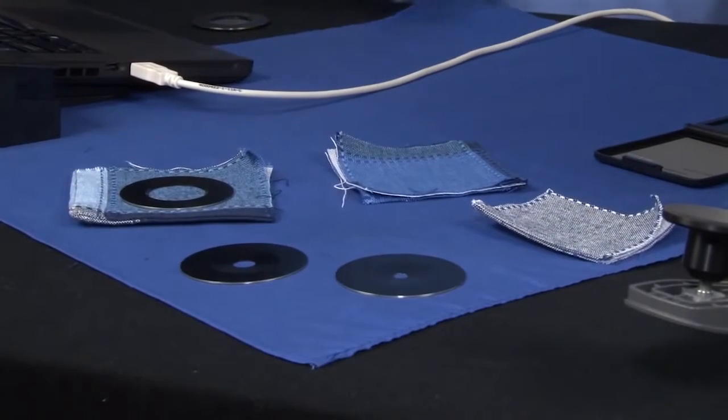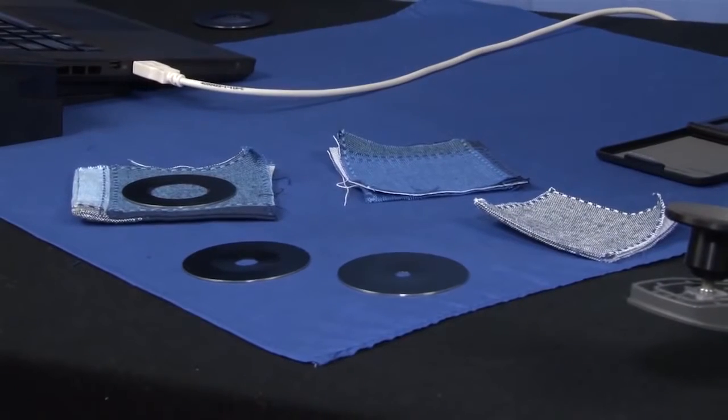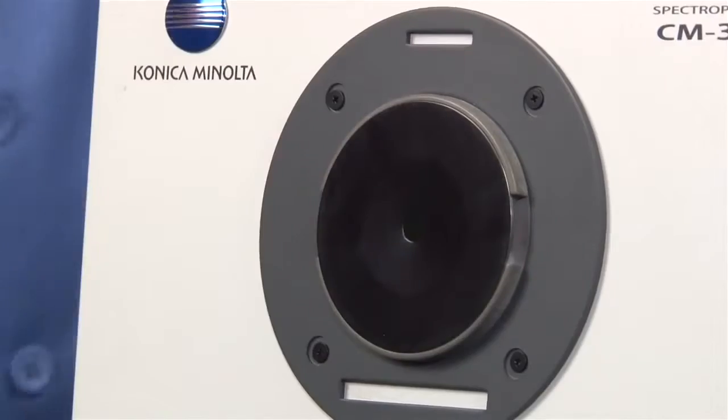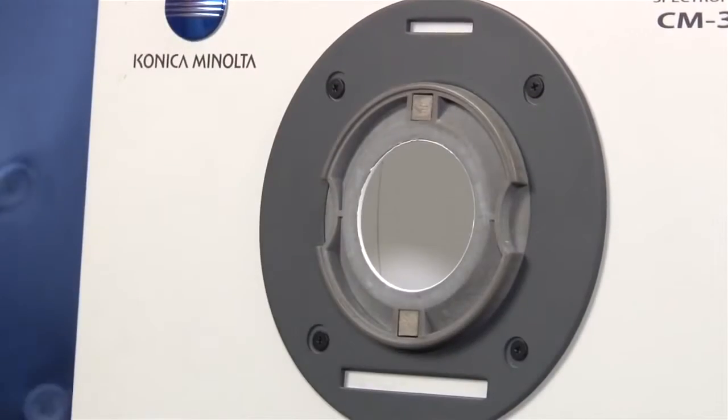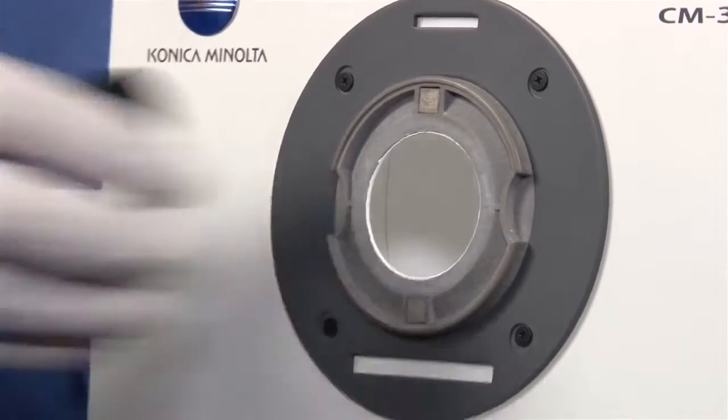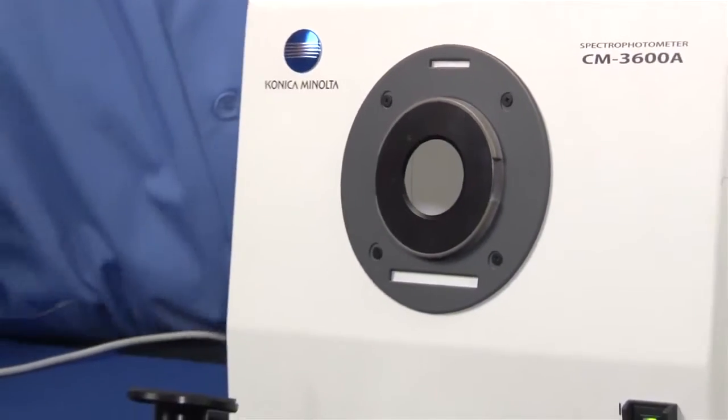The CM3600A is equipped with three different apertures, with a measurement area of four millimeters, eight millimeters, and 25.4 millimeters, to perfectly match any sample size.